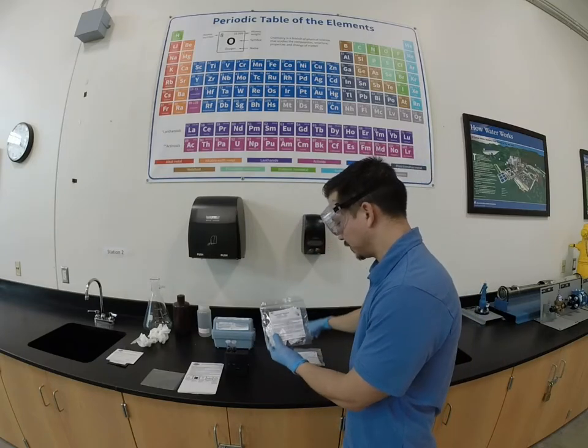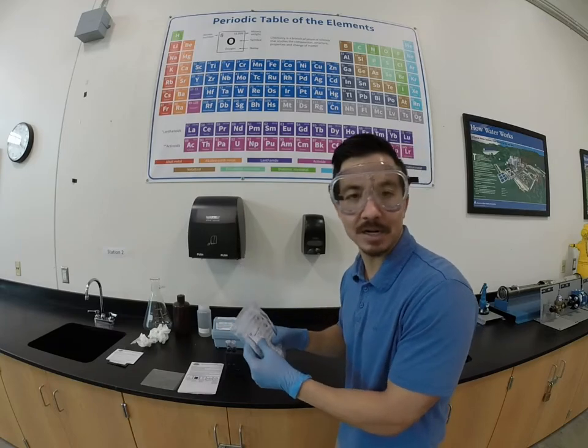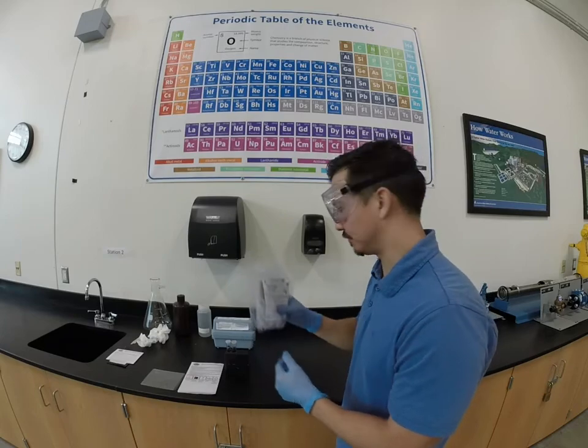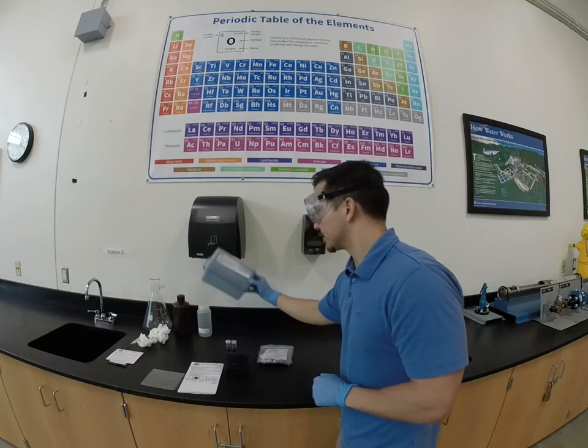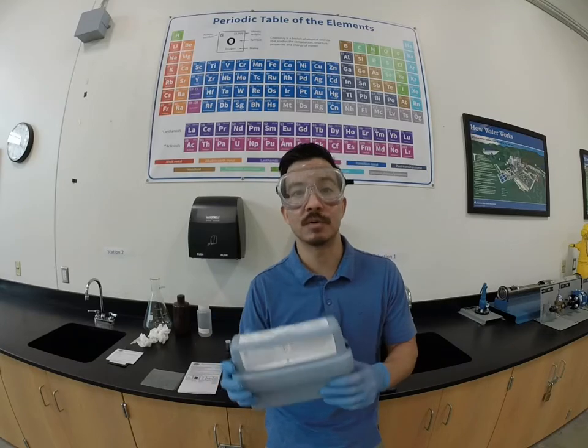Keep in mind that these reagent packets do expire. If they've been sitting in your truck for a couple of years, definitely take a look at the shelf life on these reagents before you use them. So that's it — free chlorine, total chlorine, this is how we'd measure it out in the field.